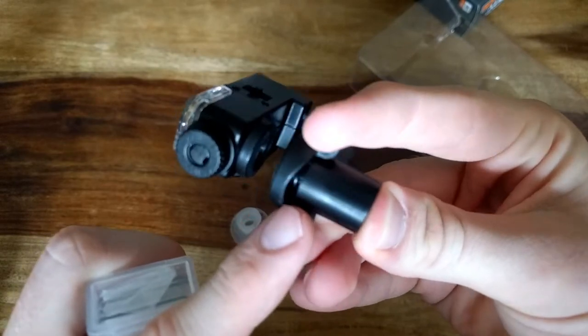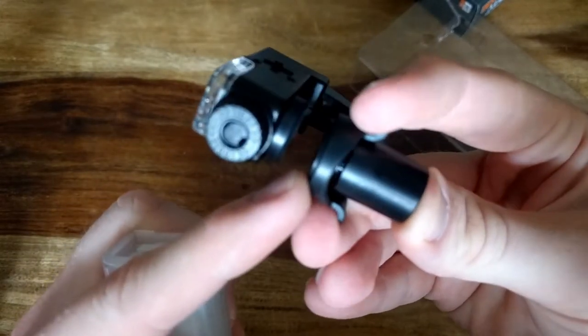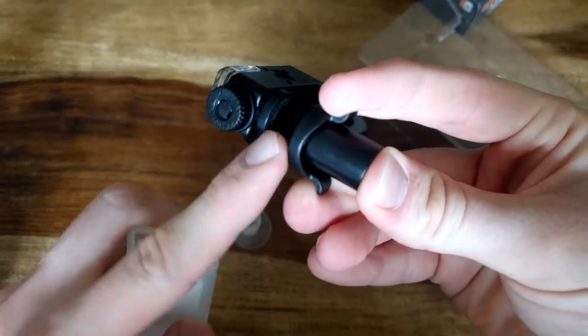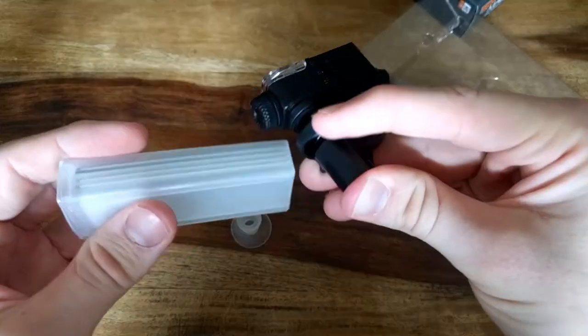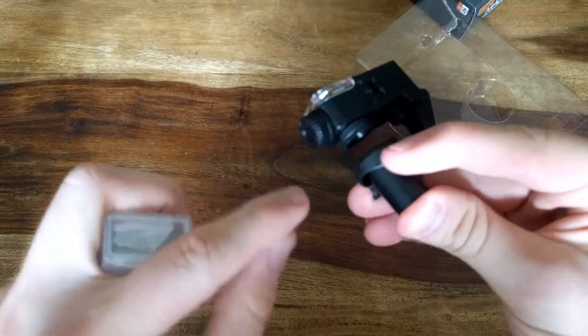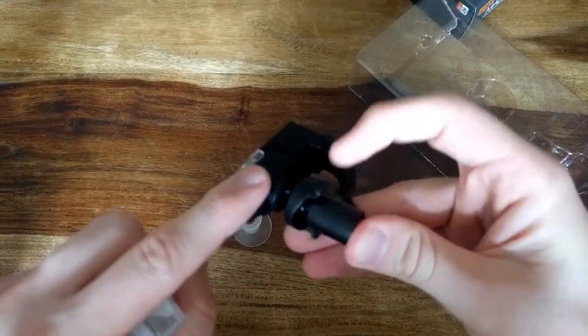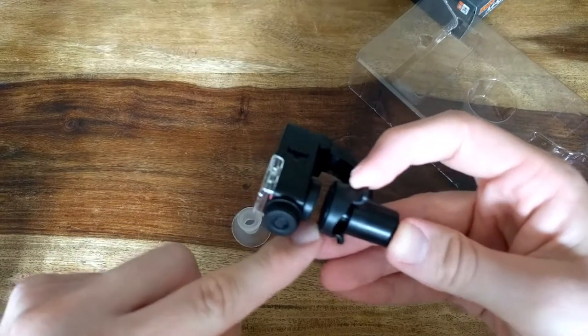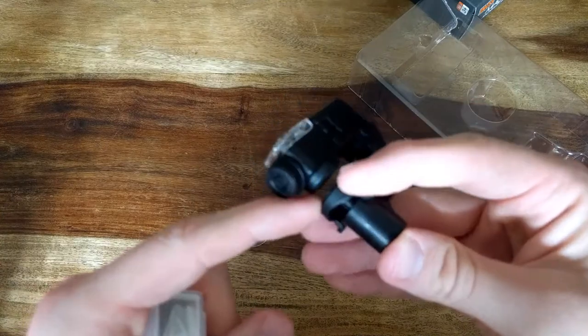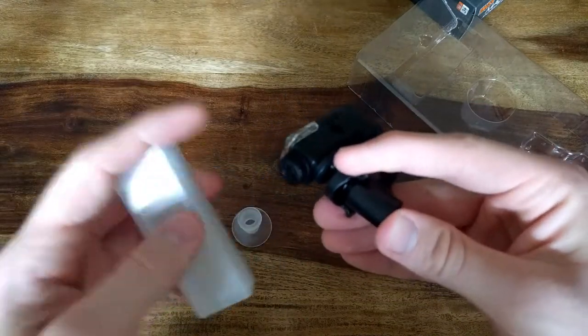There is a spring here, and on both sides of this thing there is actually soft rubber. When you put it on your phone, one piece is touching your camera on this side, and the other side is touching your screen, so the rubber prevents scratching.